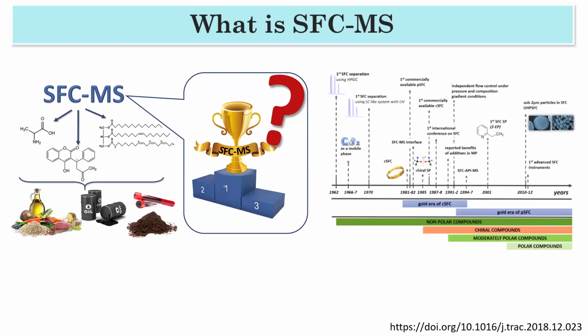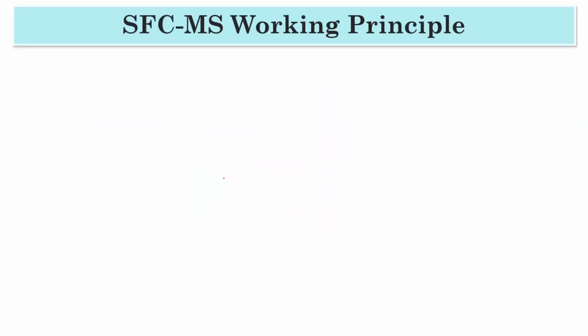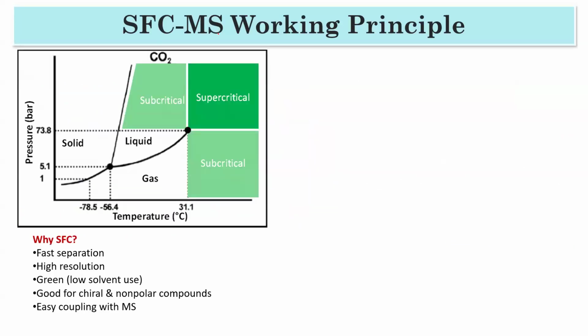So what is SFC-MS? It is supercritical fluid chromatography mass spectrometry. It started being popular in 1962, but these days the first advanced SFC instrument has been made. Previously people just used it for non-polar compounds, but now people can use it for all kinds of compounds: non-polar, chiral, moderately polar, and polar. Now you must be wondering what it actually is. So let's see.